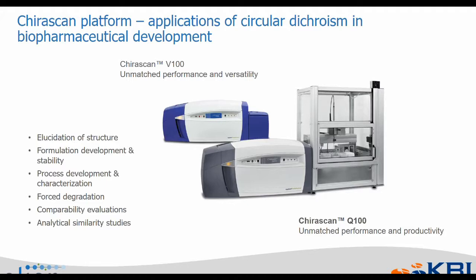In my experience, I've seen circular dichroism used for a number of different purposes during development of biologics, and I've listed some of them on this slide. Elucidation of structure for regulatory applications, INDs, IND amendments, and BLAs. During formulation development and stability. It's a good tool to use while manufacturing processes are being developed and characterized.